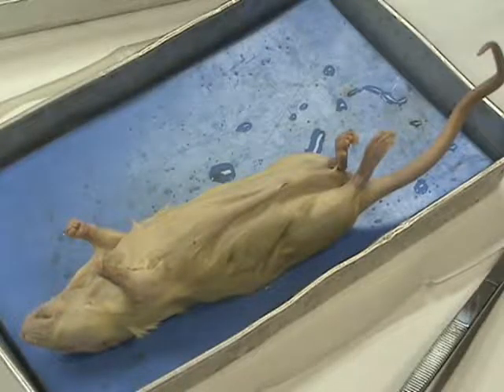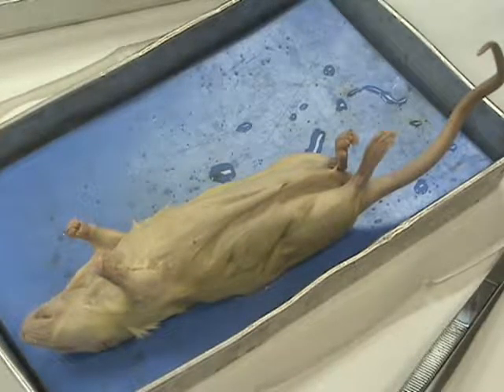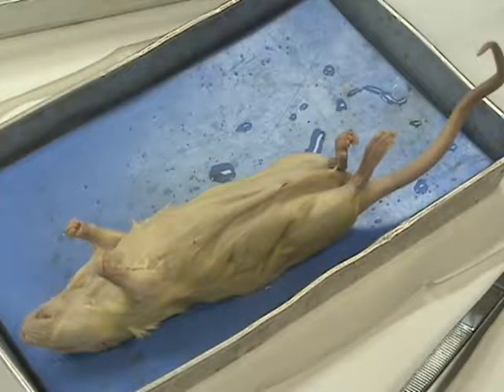Rat dissection. You've potentially picked up a sheet from your teacher at this point. If you haven't, there are a few items that you need to take care of. One of which is that you'll need to list some body systems and define some terms such as homeostasis and characteristics that all mammals have. Short of that though, there are some things that we want to show you today on the rat.